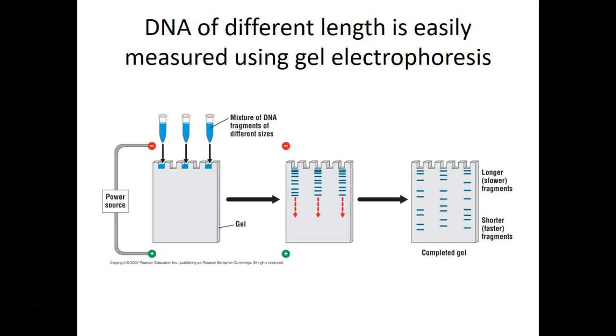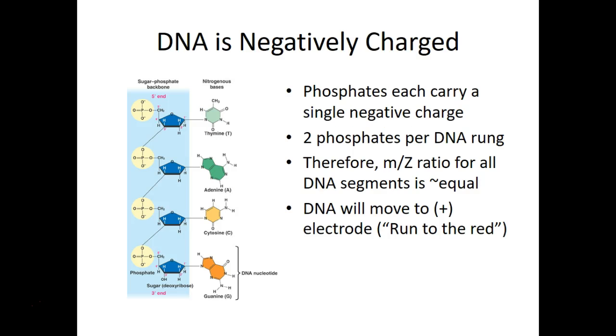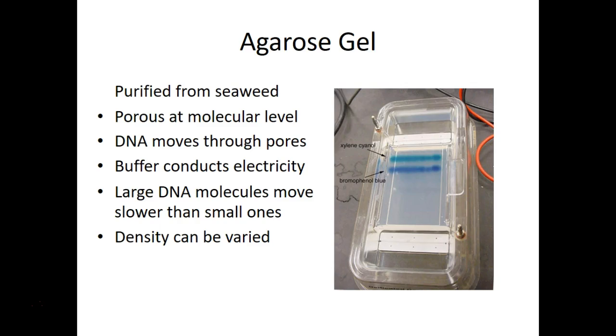So here's the technique. We use a gel, kind of like Jell-O is a gel, but this is agarose gel. Here's a picture of agarose gel. I'm sorry, I should have these in better order, and I don't. We purify that from seaweed. If you've ever eaten high chews, they have agar in them. Agarose is very purified agar. And it's a gel. It's porous at the molecular level, and the DNA moves through the pores.